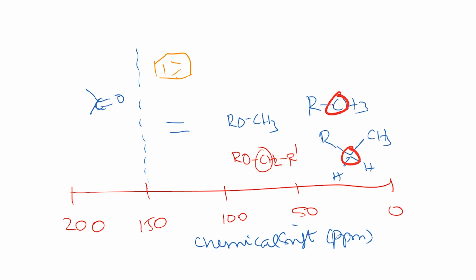So, together, if you record the proton NMR as well as the carbon NMR, you get a very, very good idea about what kind of functional groups there are, what the local environment is, etc. Okay. So, therefore, together this is going to be very useful in determining the structures of molecules. Okay. Now, what we will do is take a couple of examples and try to understand whether we can understand the NMR spectrum after looking at the spectrum.